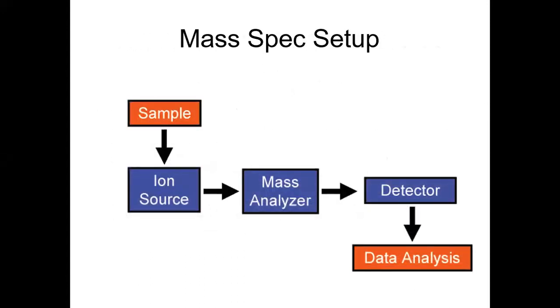So what is mass spec? How does it work? So you have your sample. You pass your sample through what's called an ion source. Normally, the ion source is an electron beam that bombards your sample with electrons, right? It's just basically a really powerful electron beam. If you've ever seen Ghostbusters, the old one or the new one, when they had those proton packs and that ray comes out of the proton pack, that's what happens to your sample when it goes into a mass spec. That's the first thing that happens, it goes into this ion source and it gets blasted with a stream of electrons, right?